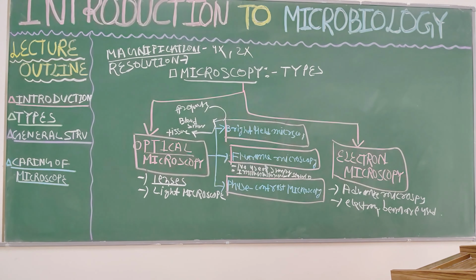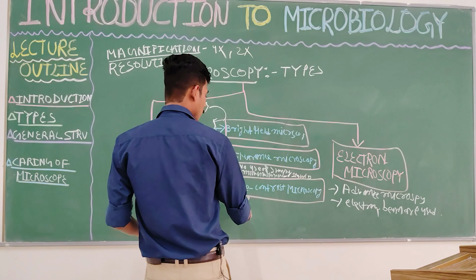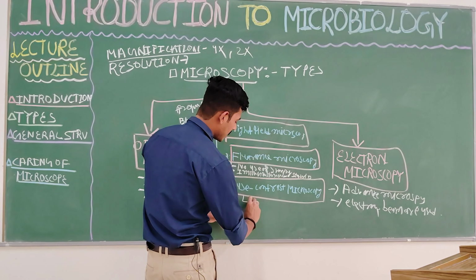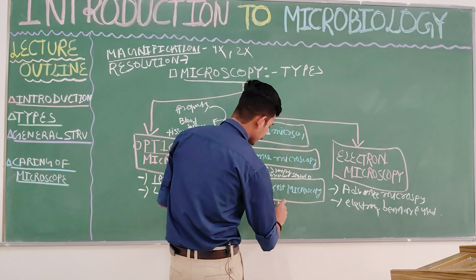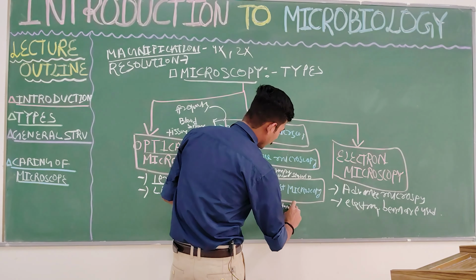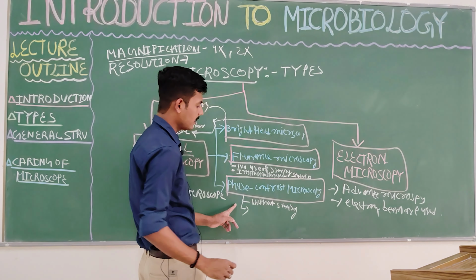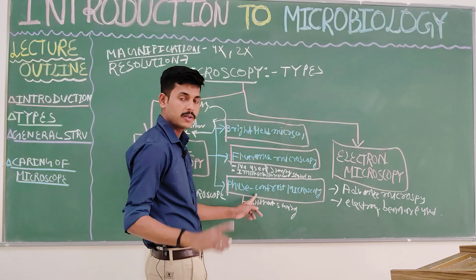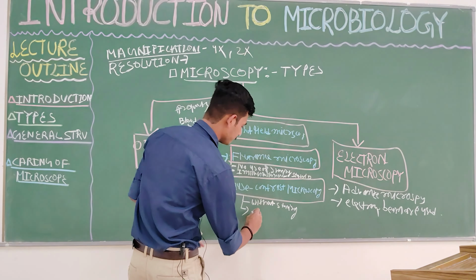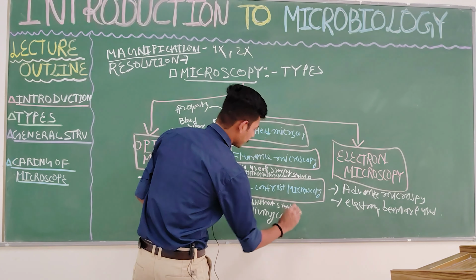We use this for understanding living cells and tissue. Another speciality of phase contrast microscopy is that, with its help, we can see the living cell.